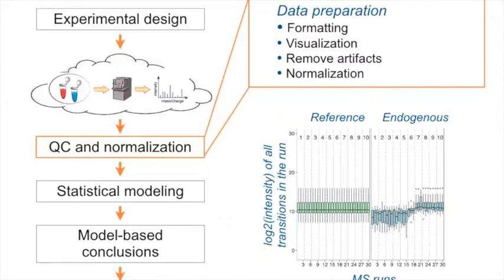IRT peptides are a good thing if you can spike them at constant concentration and you're mindful of the fact that they don't account for the upstream effects. Endogenous proteins that don't change, this will be perfect if you have them.